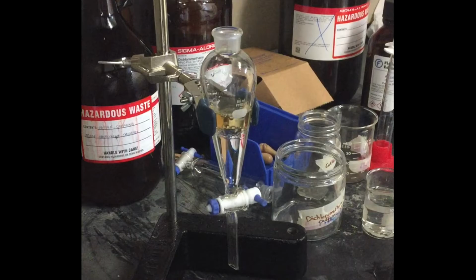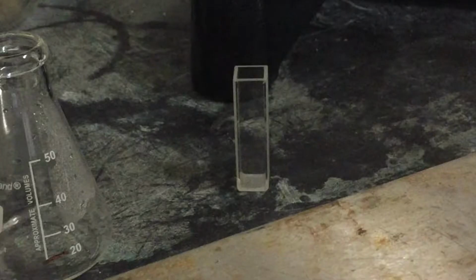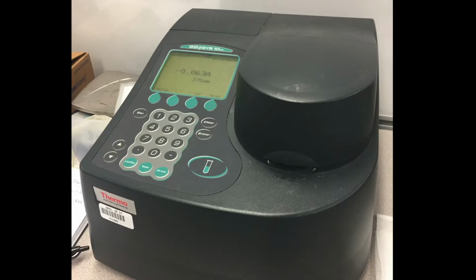The amount of caffeine in dichloromethane is determined by measuring the absorbance of light passed through a quartz cuvette. Absorbance is read by a spectrophotometer and converted to concentration using a calibration curve based on data from previous experiments.